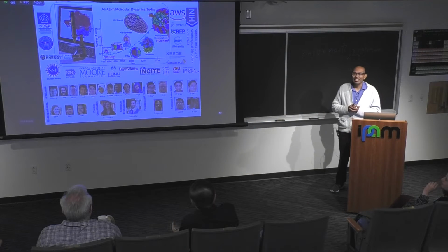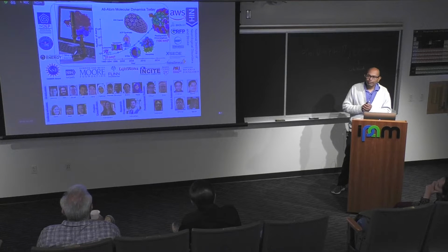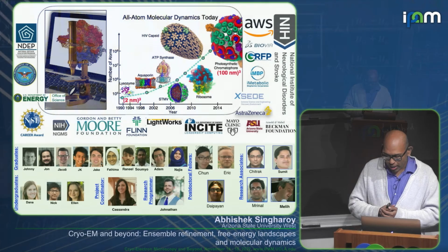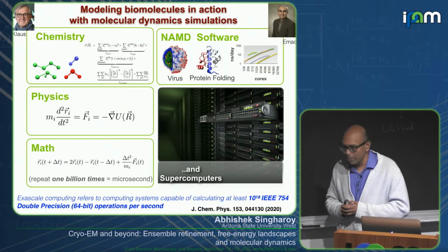We started in 2018. And so the entire team, our work is we like to think of a computer as a microscope. And we'd like to believe that in days to come, a computational microscope and a real microscope will work hand in hand, will work together. So to do that, we start out with molecular dynamics simulations.